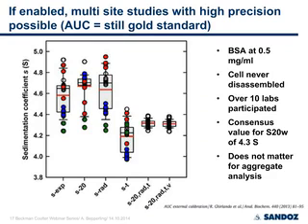What is quite interesting to see, this is a BSA standard, living forever, so to say. Peter Schuck filled it into a cell and never disassembled it, and over 10 labs participated. And what you can see here in the beginning, the S range of the monomer was quite dispersed, and when you correct the S values collected from various machines and various labs and apply all those corrections, you end up in a very, very narrow range of S values, and also a good fit for the molecular mass.